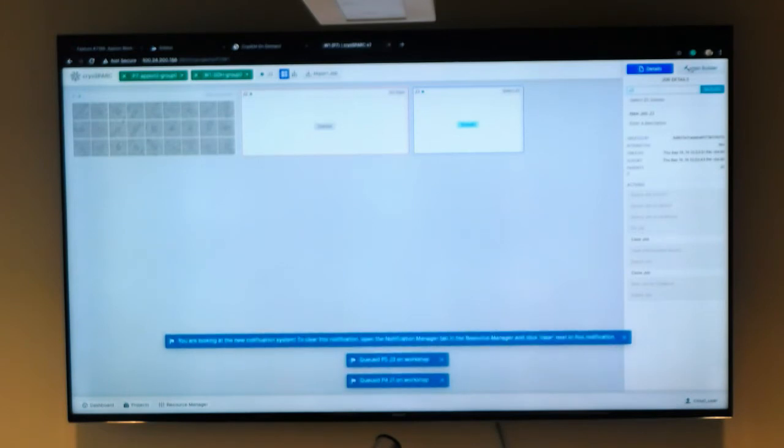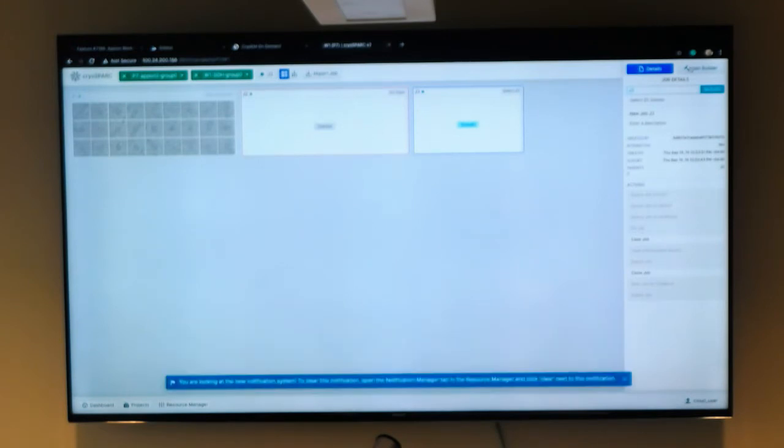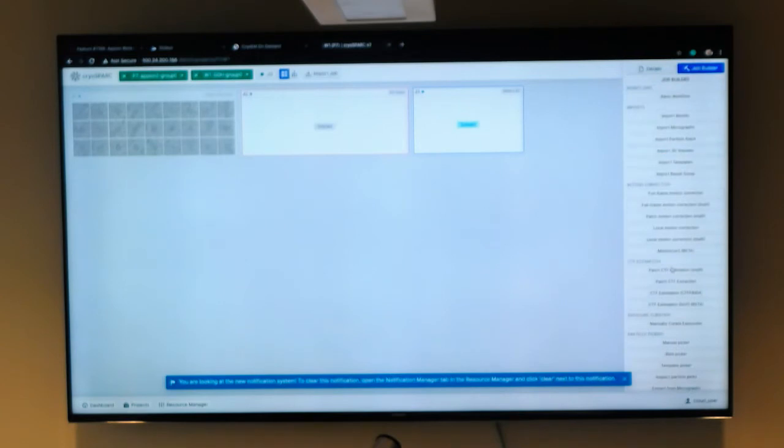and have you start. So the idea is the tutorial is there. The main thing is this should be a pretty intuitive interface. The idea is we're starting from a particle stack that has already been extracted with CTF information in there, so we can skip a lot of this.